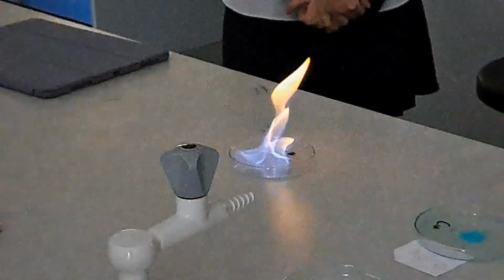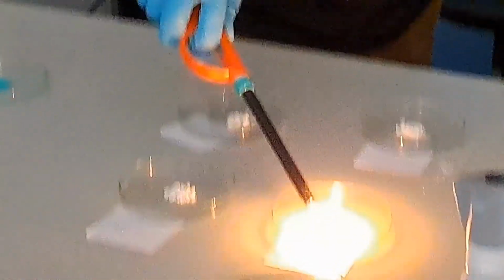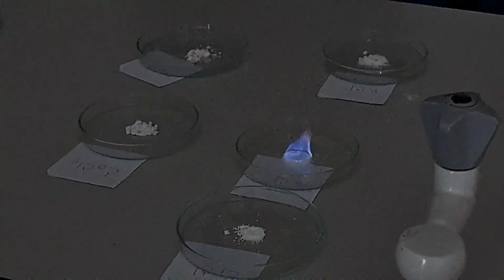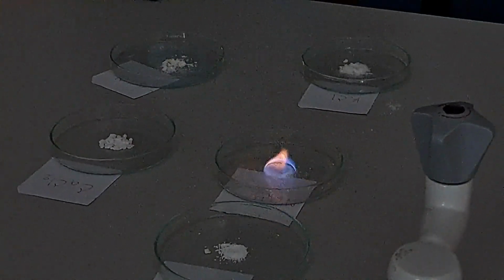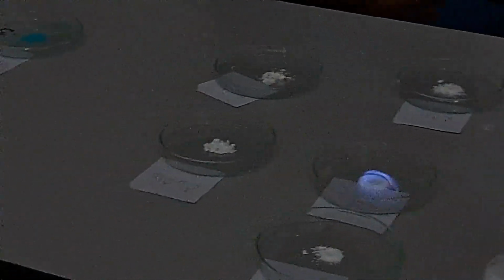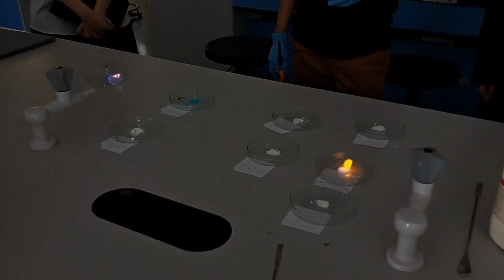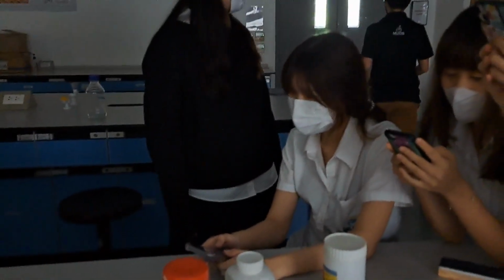Okay. All right. Let's go with table salt, sodium chloride. All right. Let's see. So it's only blue. Is there something different from the regular ethanol? Look, here is ethanol. What's the difference? Because of the wind. Oh, can you turn off the AC? That suffocates you.